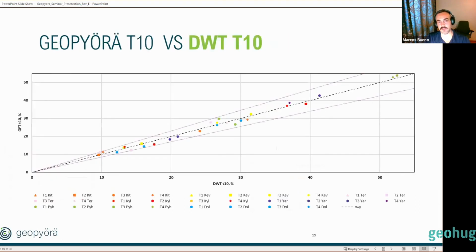But now the comparisons. The big first comparison that we did was: we are measuring energy, and there is no real way for us to more directly confirm if the energy we're measuring is really accurate. We can see that it's really precise, really reproducible, to the point of 0.1 joule.